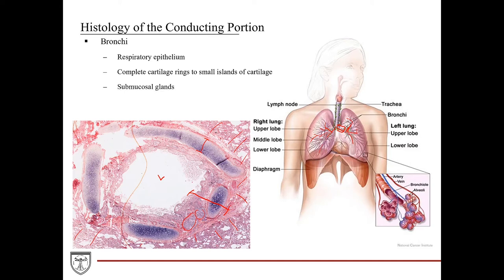Submucosal glands are identified in the bronchi, and smooth muscle starts to play a more prominent role in structural support and airflow regulation, especially as the bronchi become smaller. Lastly, there is the BALT — bronchus-associated lymphoid tissue — which is the MALT (mucosa-associated lymphoid tissue) found within the bronchial wall. It's not uncommon to see these aggregates of busy-looking immune cells within the wall of the bronchi, and this is one of the key characteristics of bronchial histology.